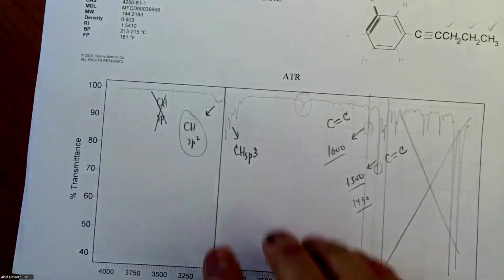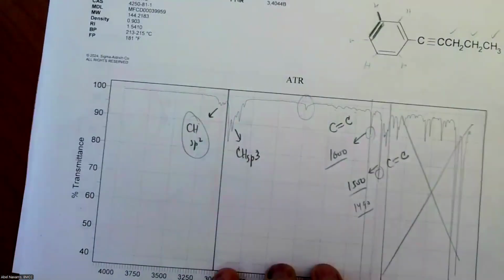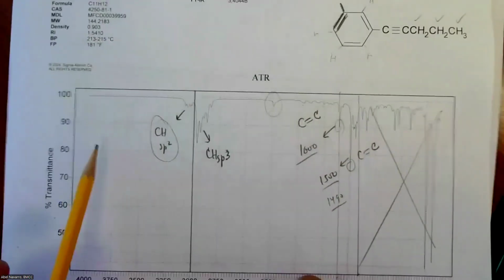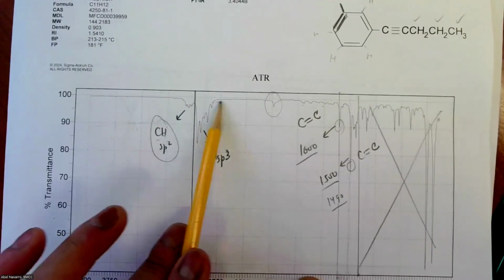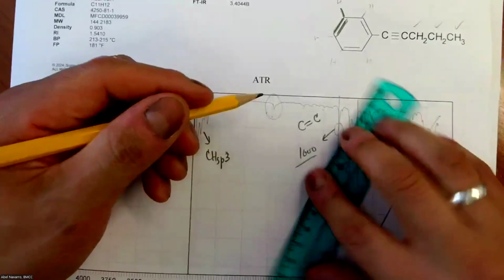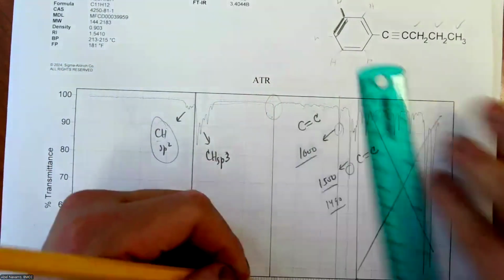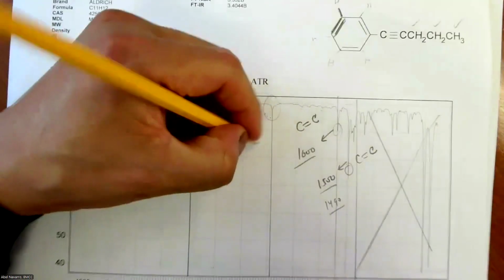Yeah, this one. So far we assigned the peaks going from left to right, and I would recommend you do that from left to right. So going from left to right, I found the CH sp2, CH sp3, and next that one. We were wondering about that one. So let's say it's right here, 2200, yeah, maybe.